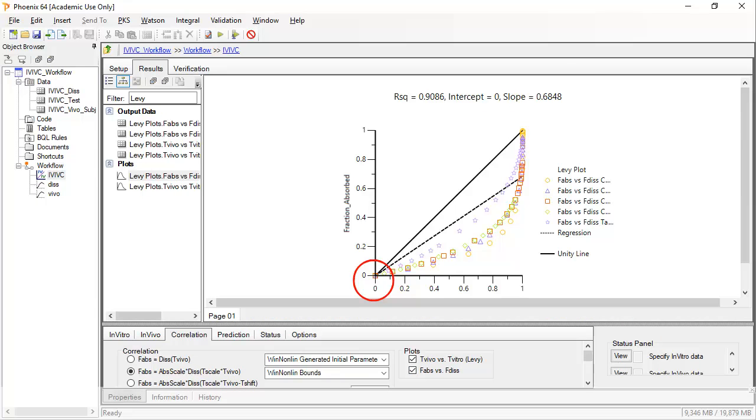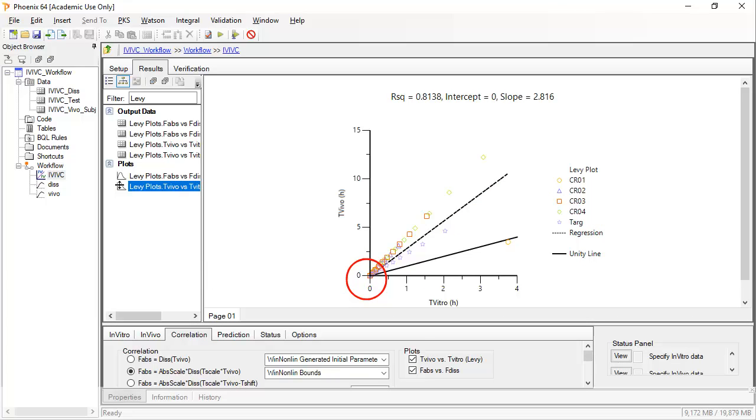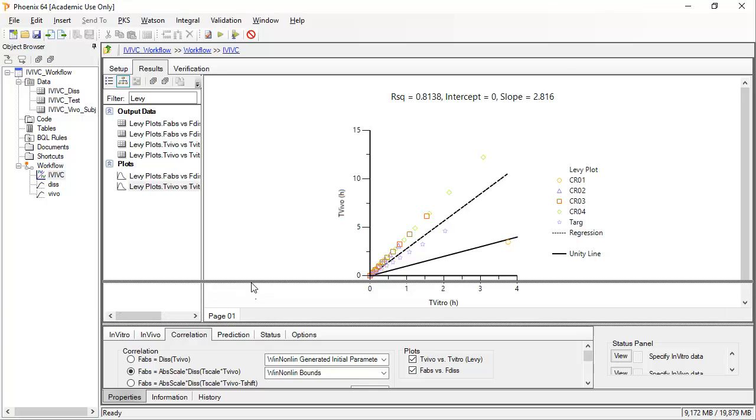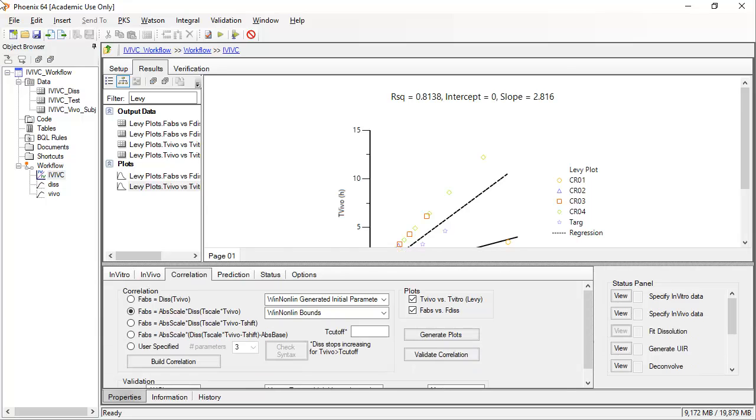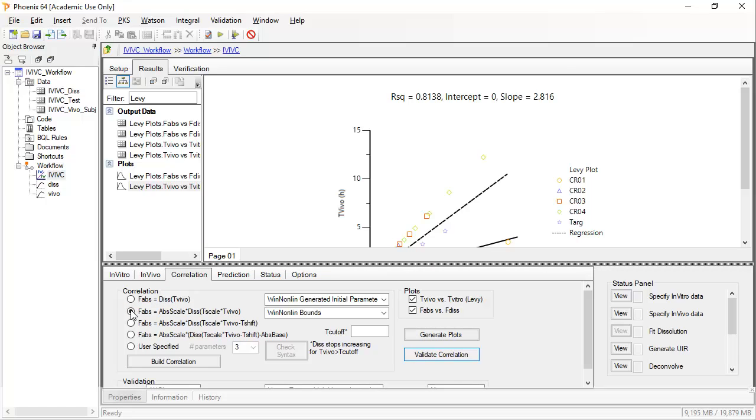For instance, if f-abs versus f-dis does not intercept at zero, then an abs scale is likely to be a required parameter. Similarly, if t-vivo versus t-vitro does not intercept at zero, then a t-shift parameter will likely be required. At present, the chosen correlation model seems reasonable and can be executed by clicking Build Correlation.